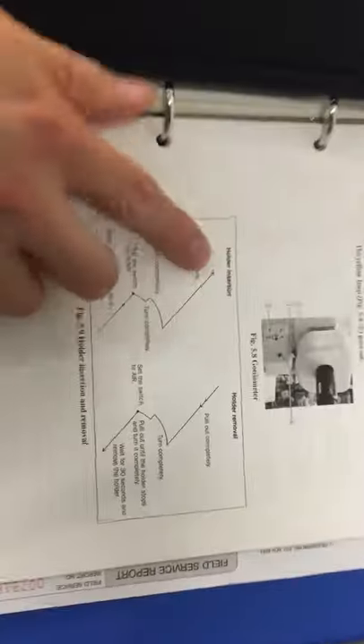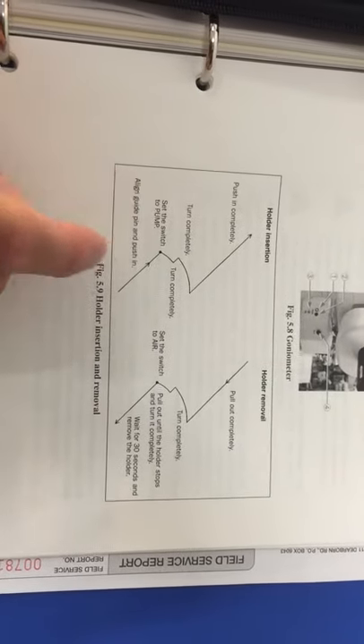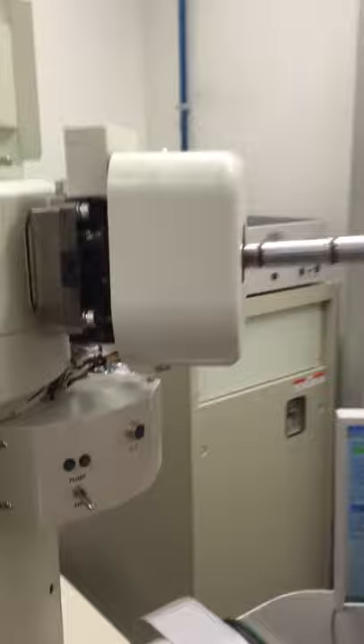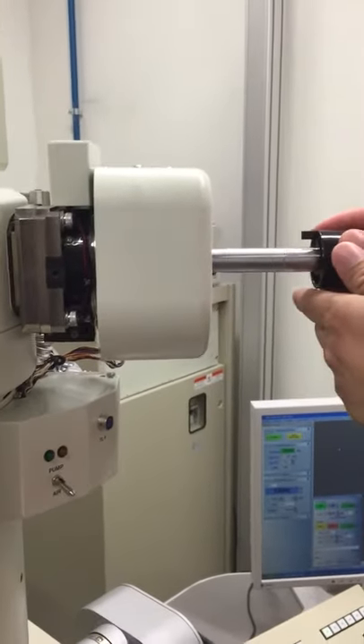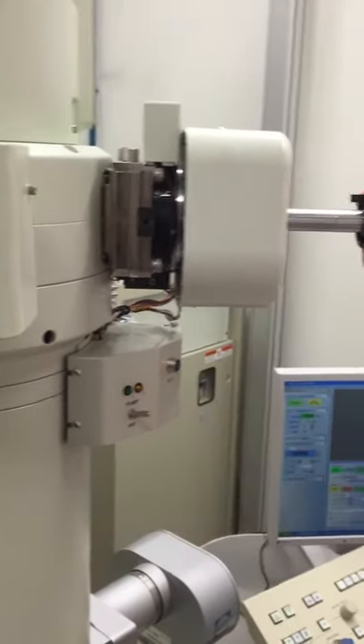So now I am ready to insert — I'd like to double check. I'm going to insert it to this point here, then switch to pump, and then I wait for the light to change and then I can turn it in and go in all the way. There's a little notch here — be careful, don't touch any part of the rod — and I'm going to line that notch up with the notch on the end of the goniometer here. You can see it's in all the way now, so I'm going to switch it to pump.